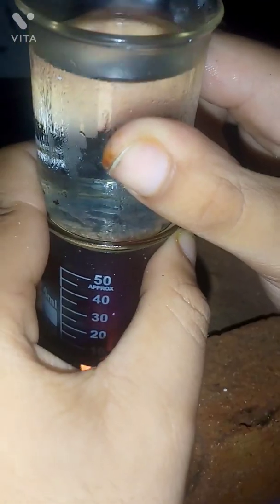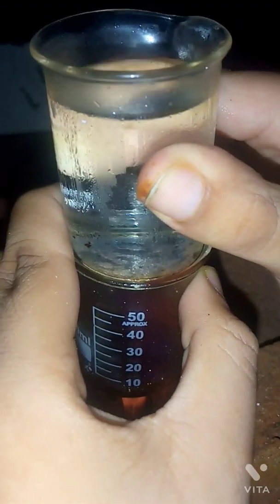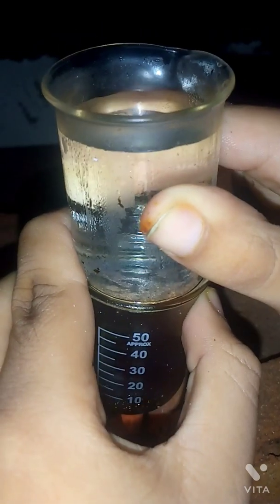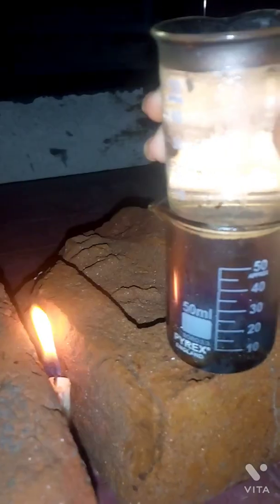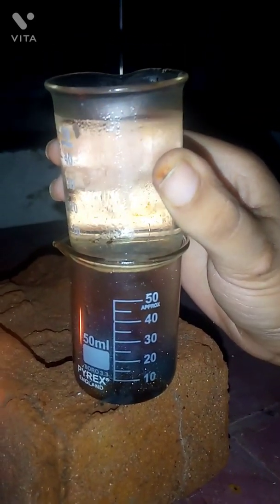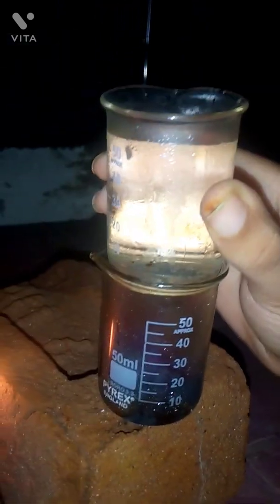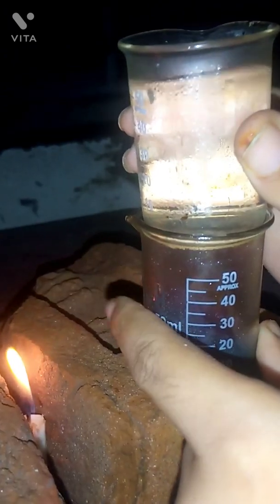And this is a Pyrex glass beaker. We need to heat this. We can wait until it cools to room temperature, and let's see what's happening inside. It is still hot. It's quite hot.